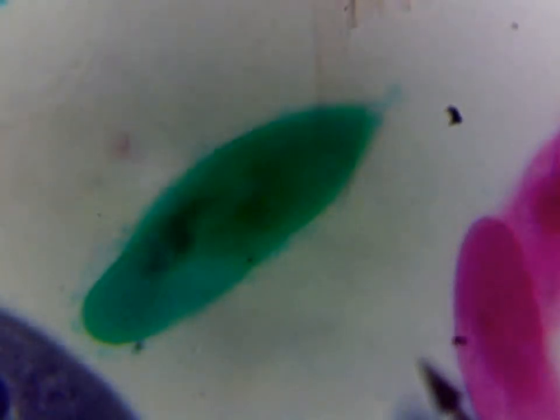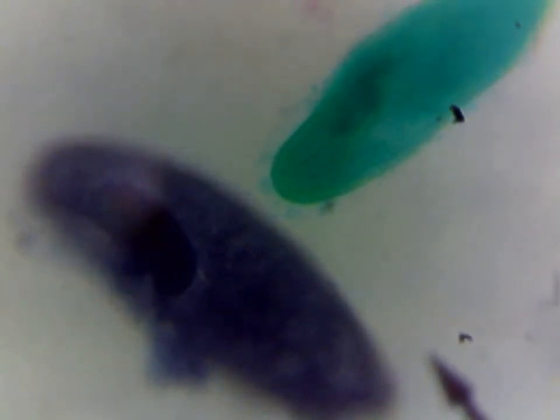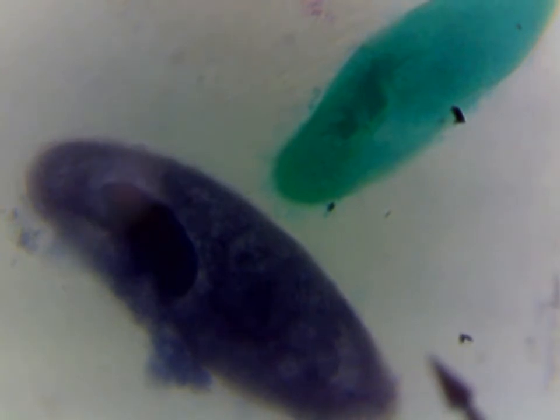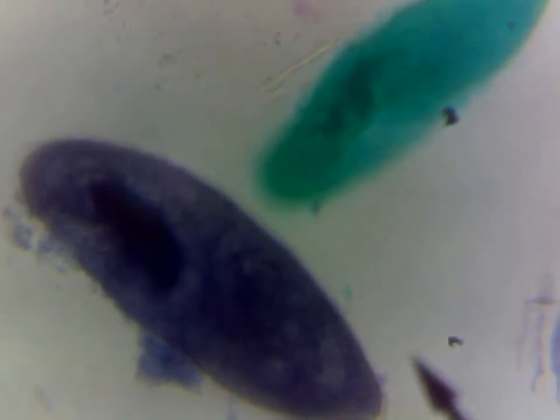Okay, now I'm going to bring it up to high power, and we'll see if we can see some structures on here. We should be able to see some structures on an individual Paramecium. Here's a good one. So you'll want to be able to locate the oral groove, and then you should see there's like a really thin ring of green around that. Here's a ring of purple around this one. And those are the cilia. Very, very faint, but those are the hair-like structures that help these organisms move. So pause the video and draw one with the structures.